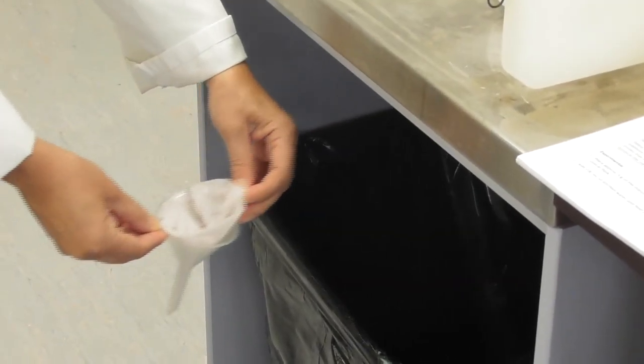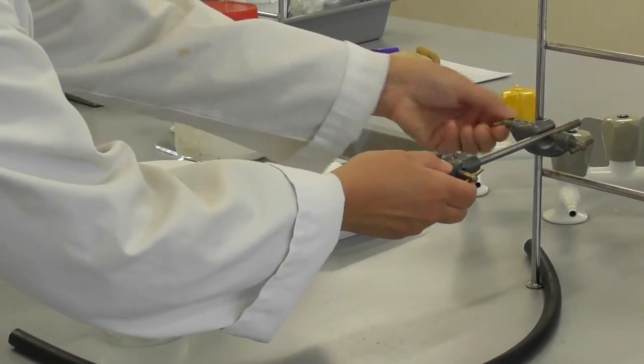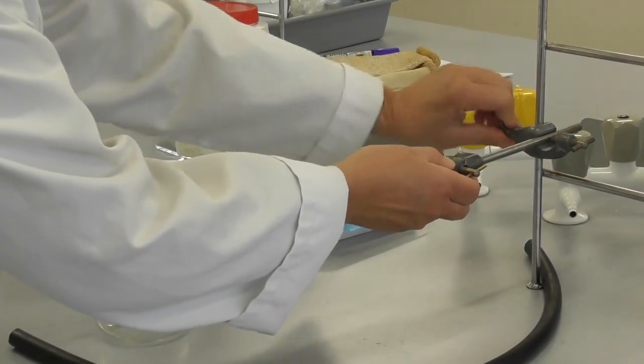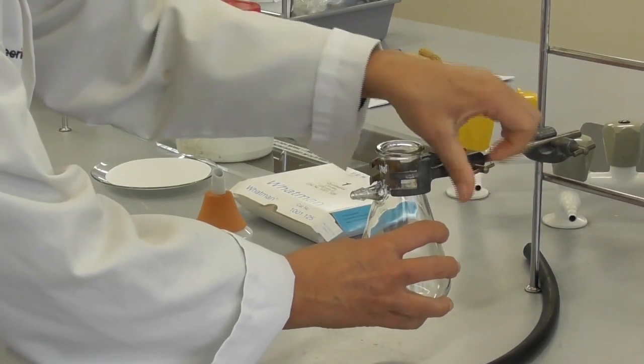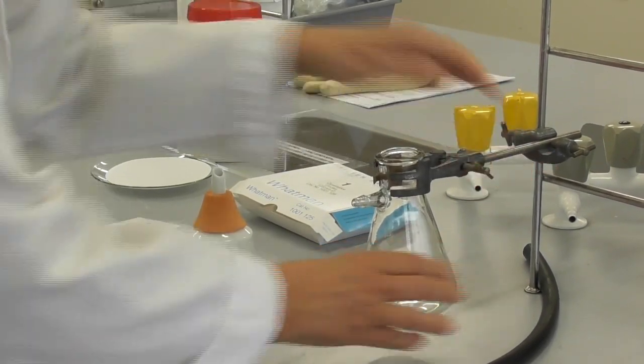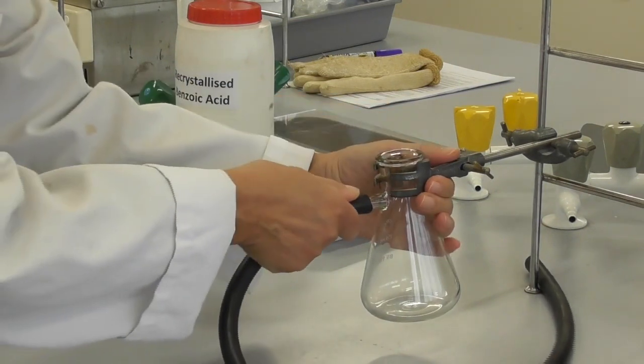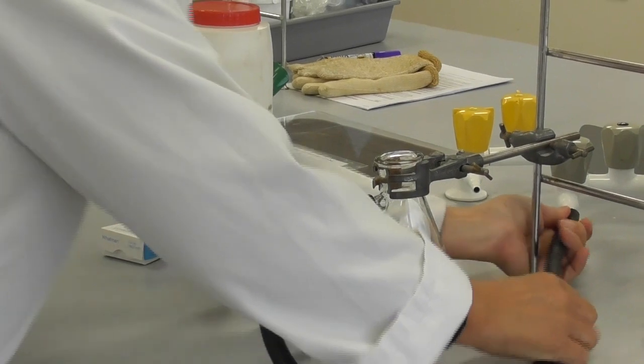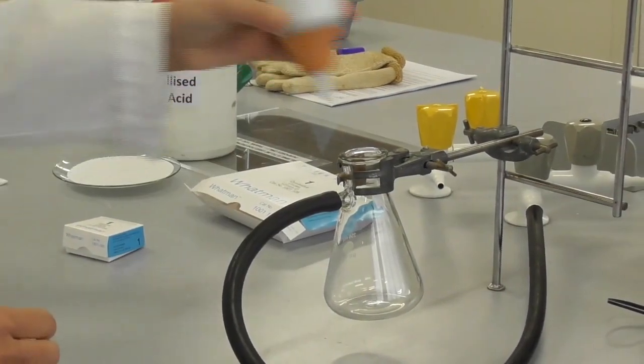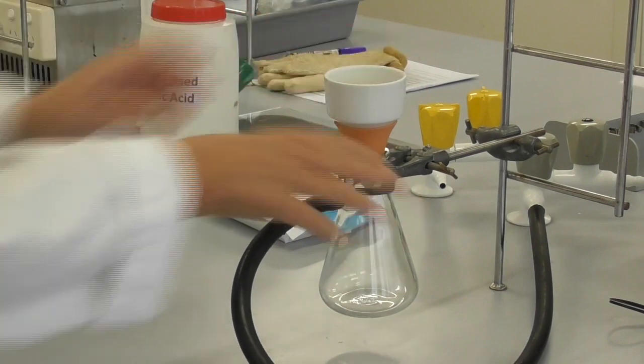The used filter paper gets thrown out into the rubbish. Next we set up the vacuum filtration. We clamp the vacuum flask securely, add the vacuum hose and connect it to the vacuum outlet, and then set the buchner funnel on top of the vacuum flask.